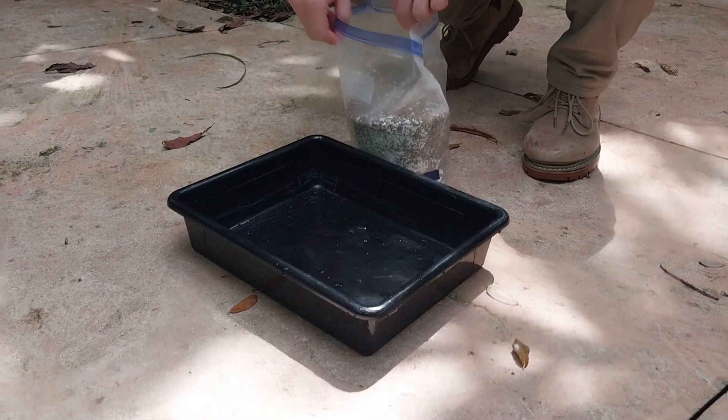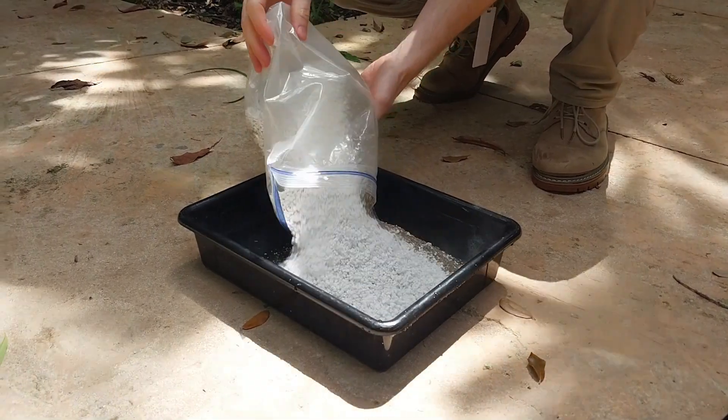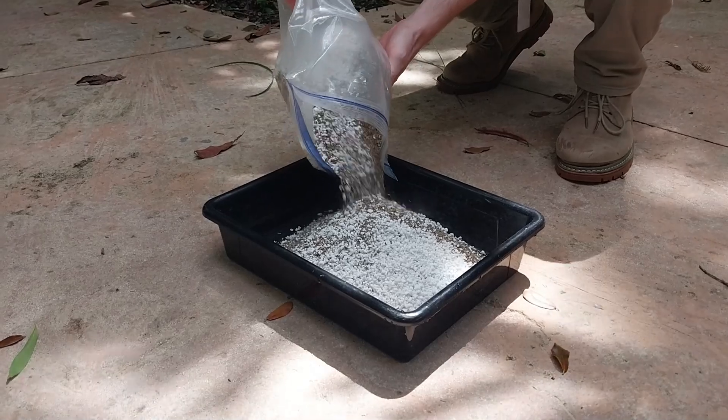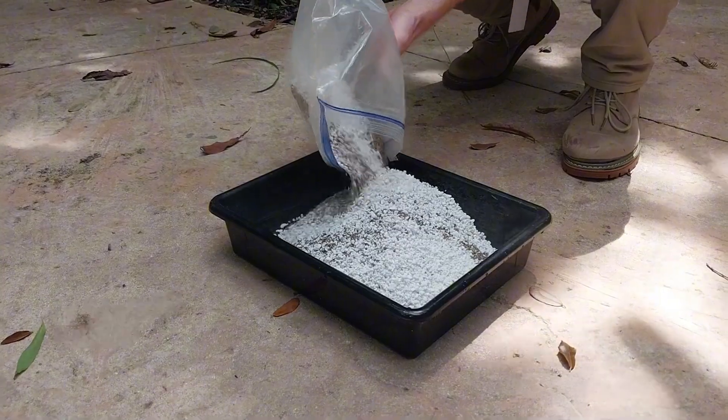To begin, first take the 50/50 perlite vermiculite mix and pour it into the mixing bin. This mix will produce dust when agitated, so it is recommended to pour the mixture outside. Next, you will get around 700 milliliters of water.